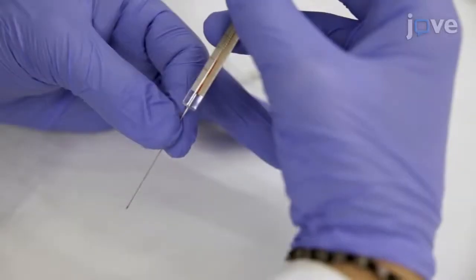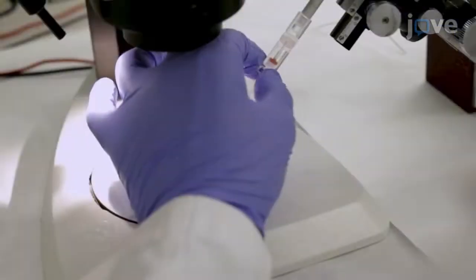Load a pulled glass pipette with two microliters of calcium green 1 dextrin solution and place it in the microinjector.